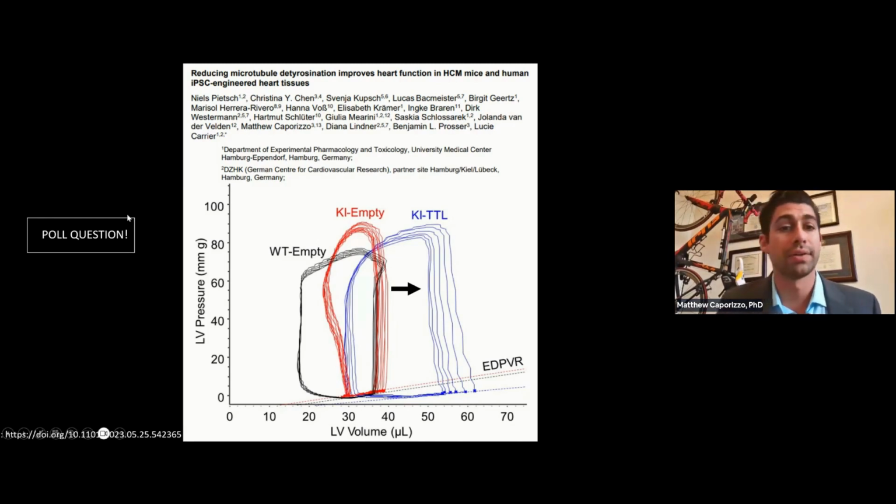Because I know we've added it onto the IonOptix system, and it may be something that could be folded into the IonOptix software in the future.